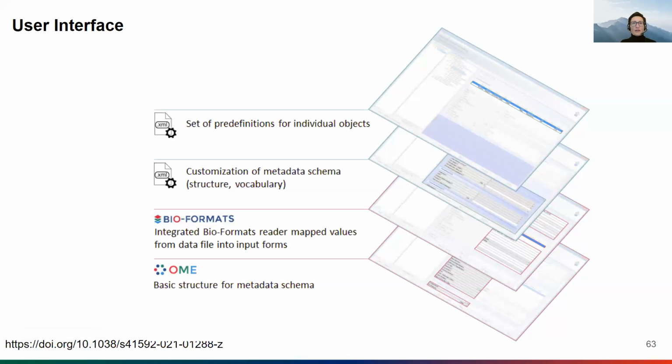At the basic level, we have the structure and vocabulary of the OME schema that are provided to the user as input forms. On the second level, Bio-Formats is used to read out all the metadata stored in the image file to this OME schema and load these values into the input forms.